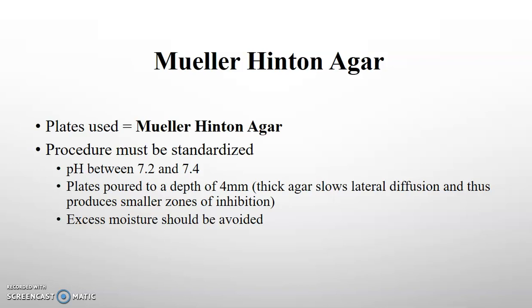The problem is if you pour the agar too thin, and let's say it's only 2 millimeters, what happens is the medication can diffuse too fast, and it can actually make the antibiotic look more effective than what it should naturally be.